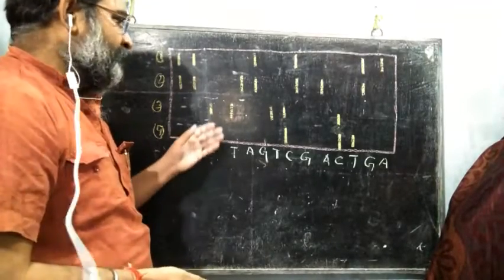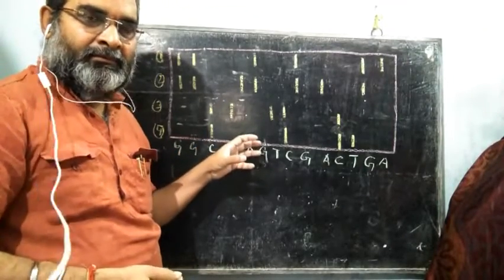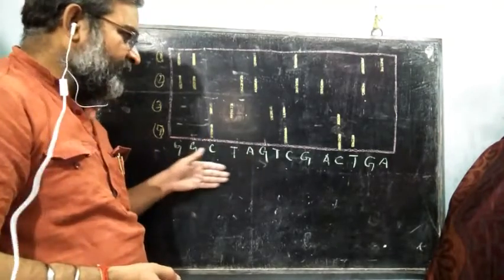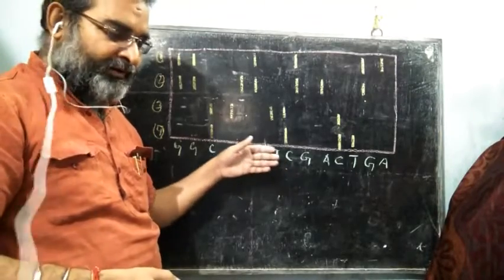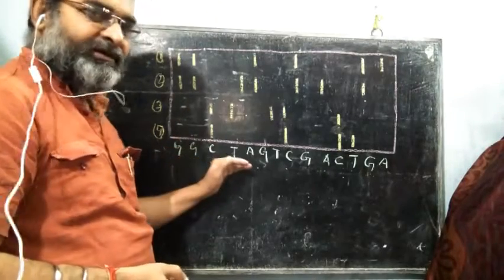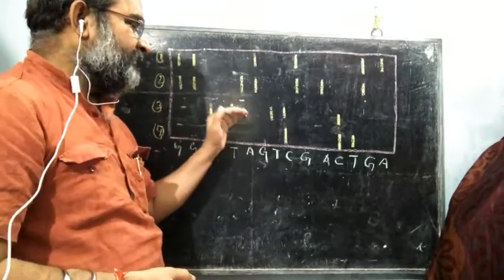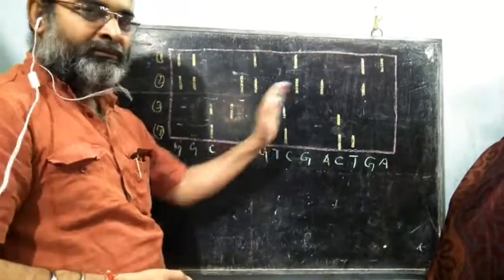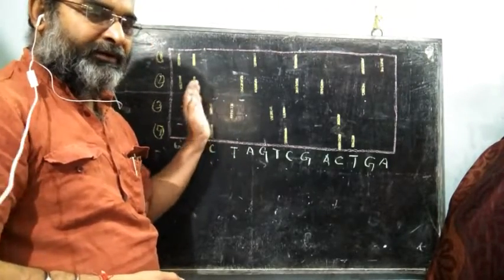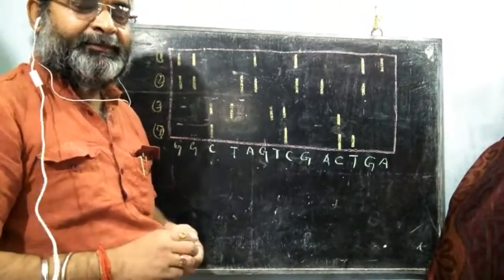In this way, we can analyze the banding nature and corresponding DNA sequence, because we analyze the DNA sequence by spotted structures of the bands dispersed throughout the electrophoretic field. It is referred to as wandering spot analysis.